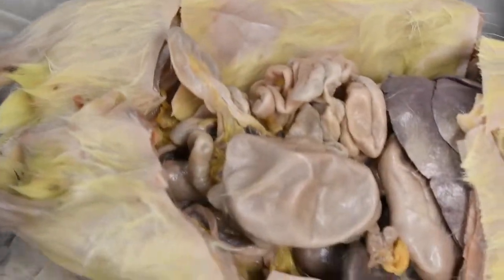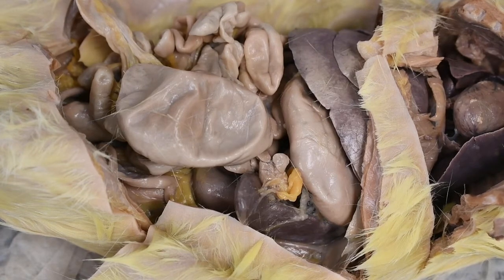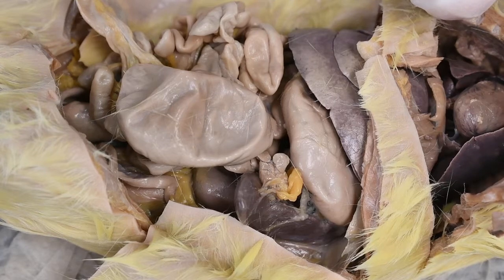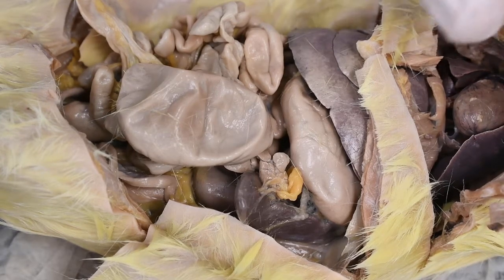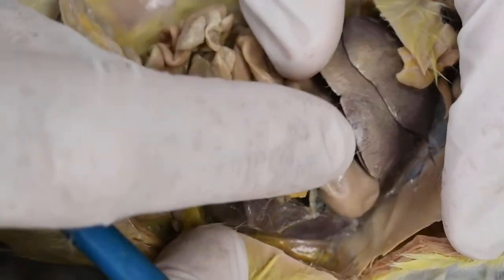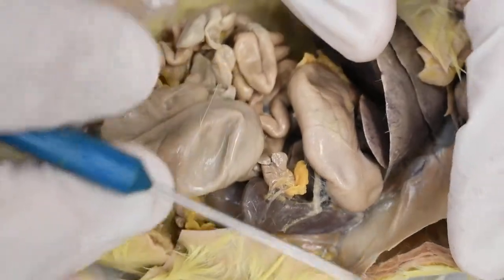So the digestive tract, you already saw that in something like a frog, the intestine has a couple of divisions, or 3 divisions, I guess. Here, there's even more. So let's take a look at this, and we'll move through it one step at a time. So right here, between the liver and the spleen, you can see the stomach.